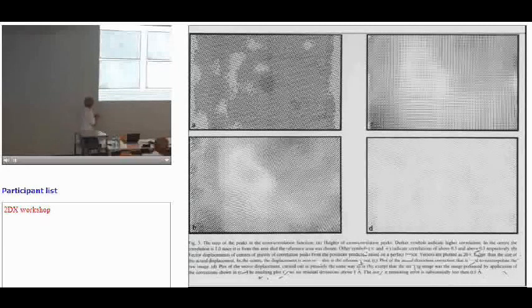And this is the height of the cross-correlation peaks. And obviously it's highest in the middle because you're cross-correlating not just the molecules, but also the noise that's been averaged by a little bit of filtering. And then this next one is the distortions from a perfect lattice plotted out. And obviously in the middle, where you start from, the central point has 0 and 0, and then as you go out, it gets more distorted. And they're of the order of 0.5%, so it's a pretty good crystal.